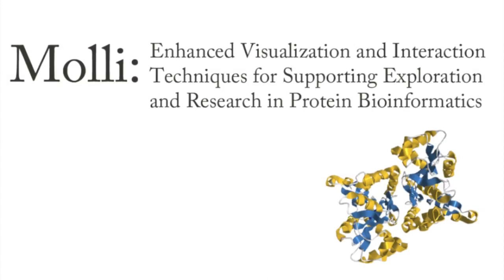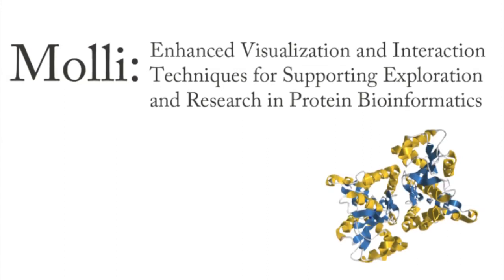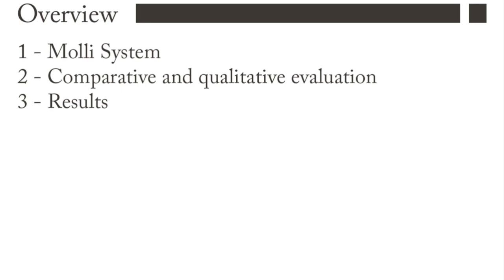We present Molli, a new protein visualization tool. In this video, we will first demonstrate system features. We will then discuss the comparative and qualitative evaluations of Molli and conclude with results.